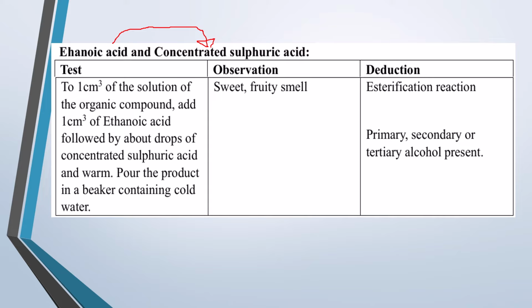We shall tell you that after doing all that, you pour the contents of your resultant solution into a beaker containing cold water. Now when you do that, you must observe a sweet fruity smell. And we talked about that under esterification reactions when you were beginning the video. So the instructions, like I said, are going to vary.